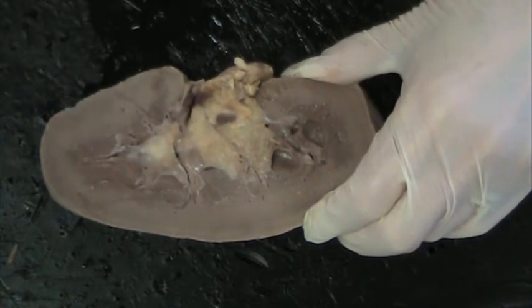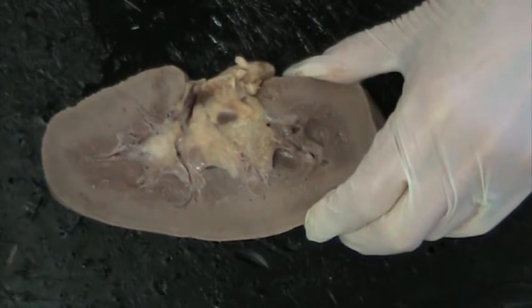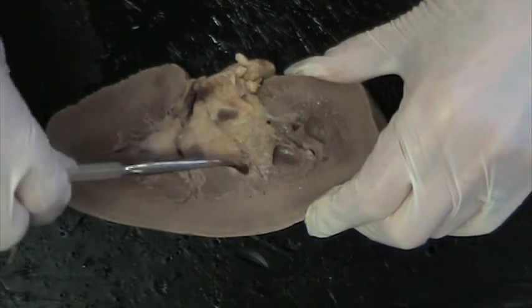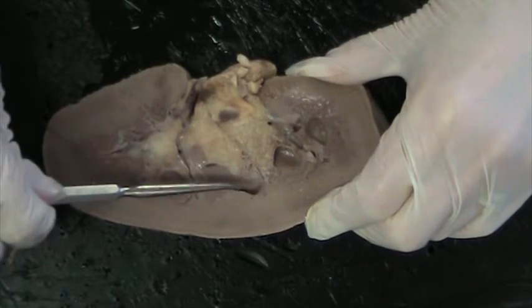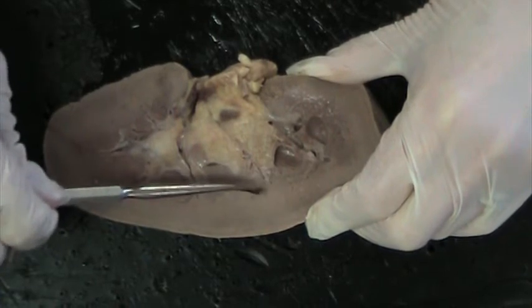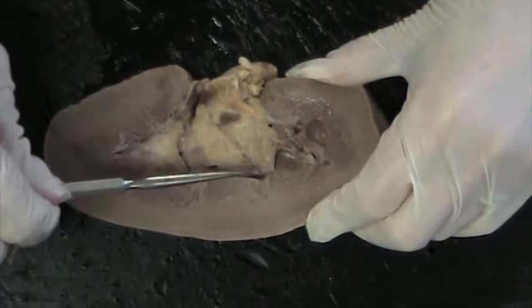Now I'm going to start out by talking about how the blood comes in and filters. The blood comes in the renal artery, and it goes up these structures called renal columns. The renal columns come up, then the blood goes into a structure called the Bowman's capsule. In the Bowman's capsule there's a tangle of vessels called the glomerulus, and that's where filtration actually starts.